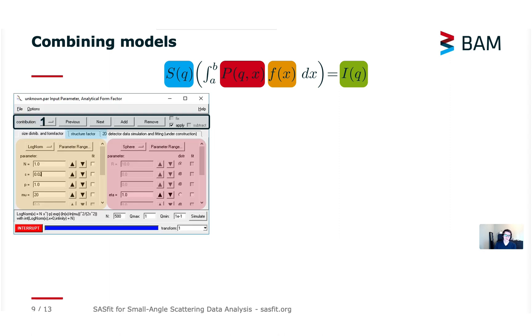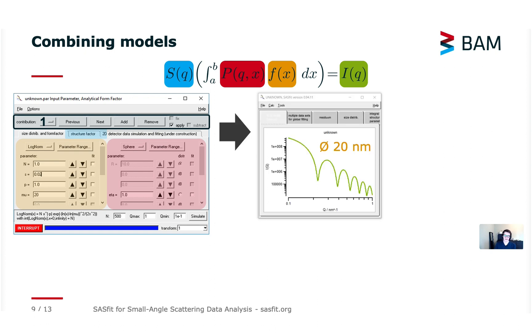Another important point here is the upper bar of the configuration window where you can select the contributions. This is where you can stack together your models and add multiple scattering models together because every contribution is just added to the contribution before and the sum of all the contributions make up your intensity pattern which is then compared to the measured intensity. So here I tried to visualize this.